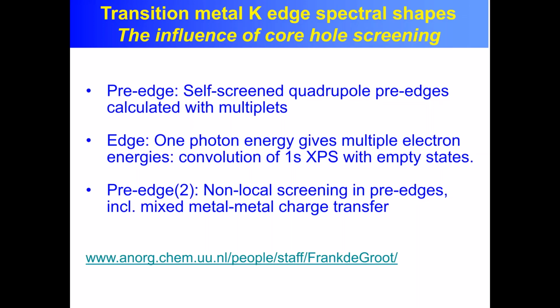Is that correct? That I don't know by heart. I know a lot of the soft X-ray spectra on lithium nickel oxide, but not the hard X-ray. So if we were to do HERFD on lithium nickel oxide, would we expect to see a non-local interaction purely because the oxygen is charge compensating? Yeah, it would certainly be very interesting to look at that.